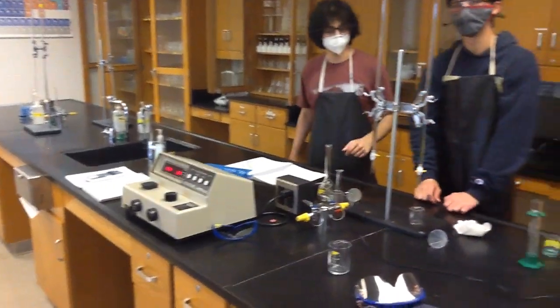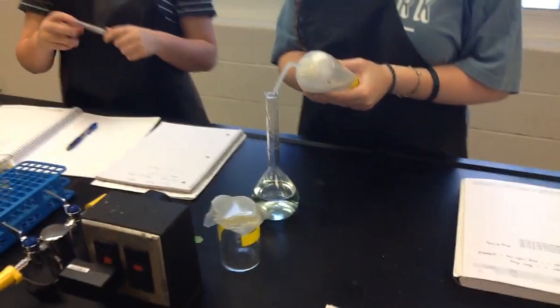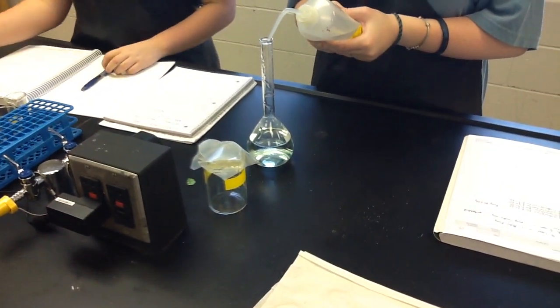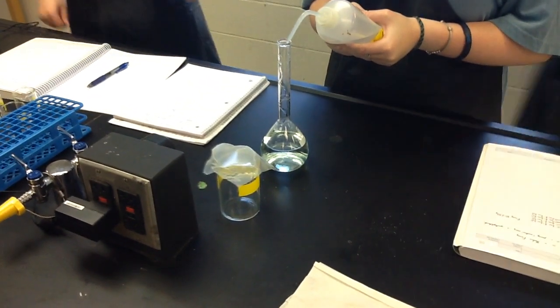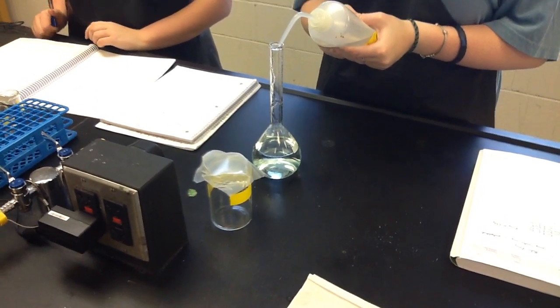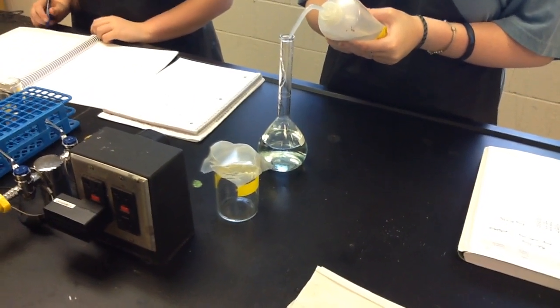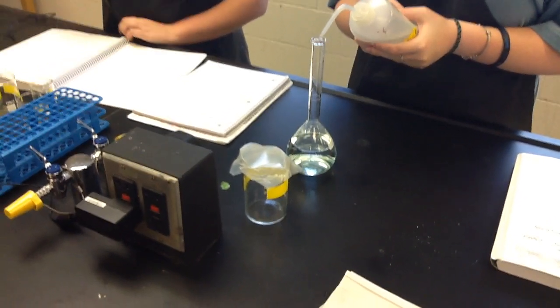And then also, what did we do here? Has anybody diluted your penny yet? You're working on this. Okay? So, I dissolved a penny into nitric acid like we did at the very beginning of the year. Okay? And they then took that solution and poured it into this 250 milliliter volumetric flask. They're now filling it up to where the bottom of the meniscus is on the top of the line, so we know we have exactly 250 milliliters of our solution.